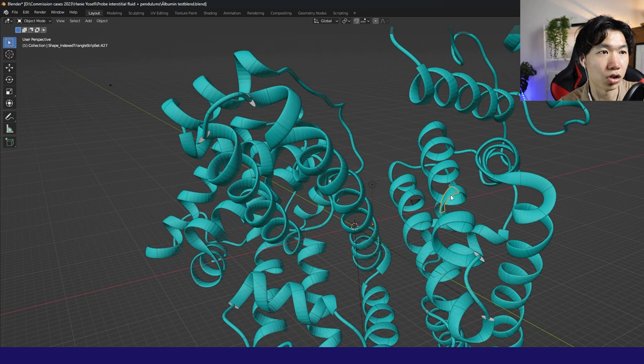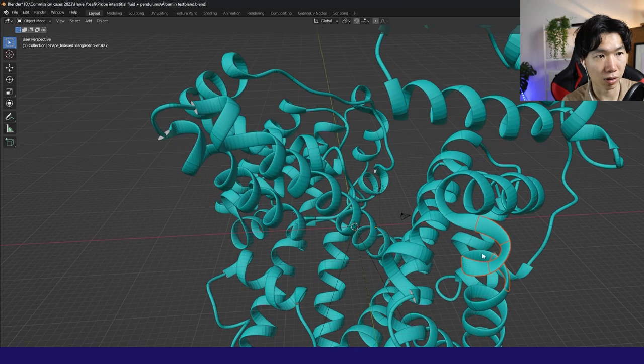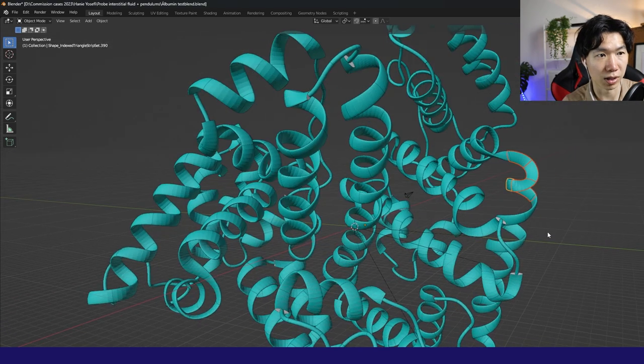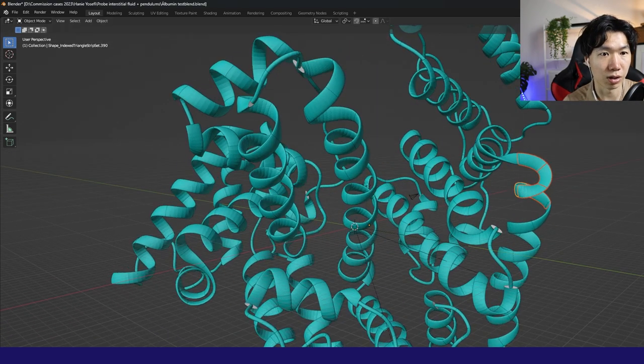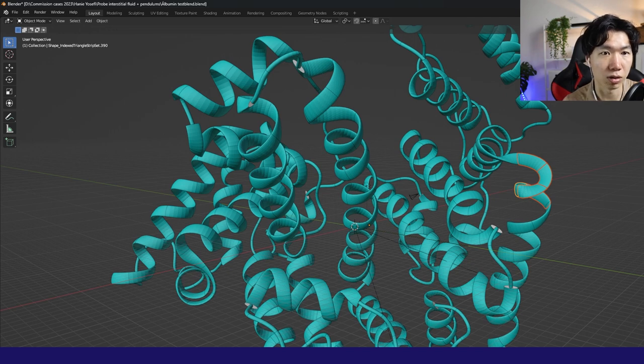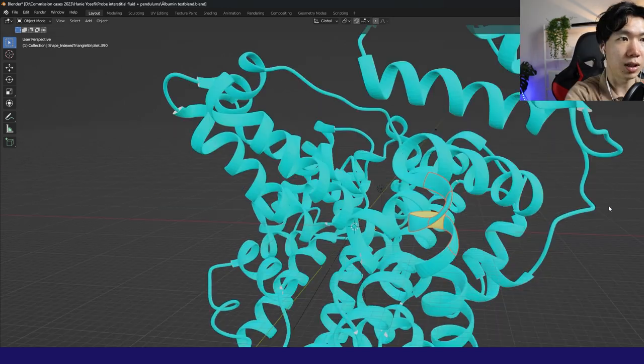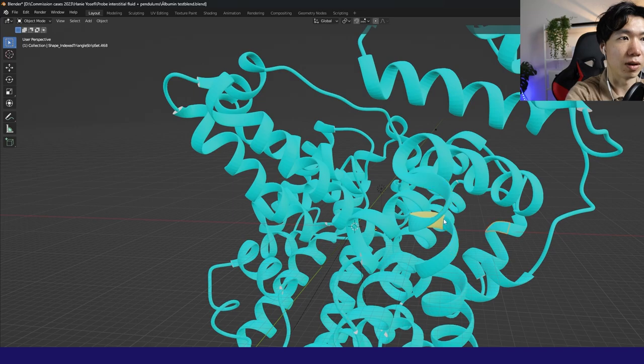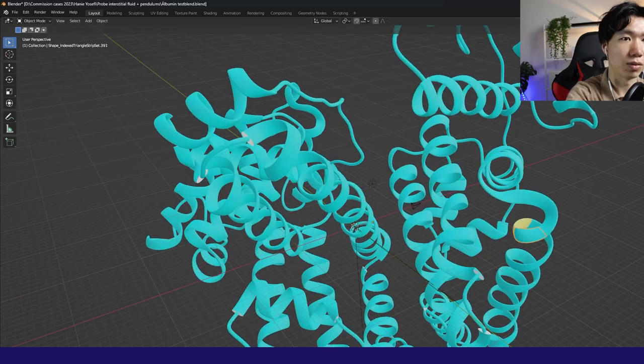Look. And you can change the color of specific part of the protein. For example, here, if I want to change the material color, I can do that. See, now some of them are yellow.